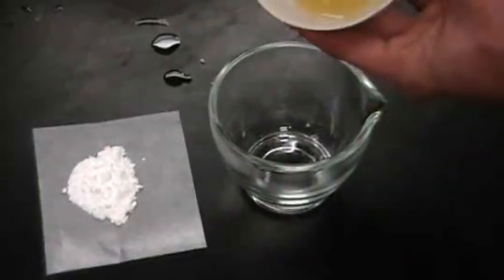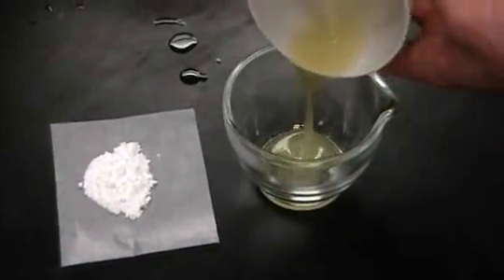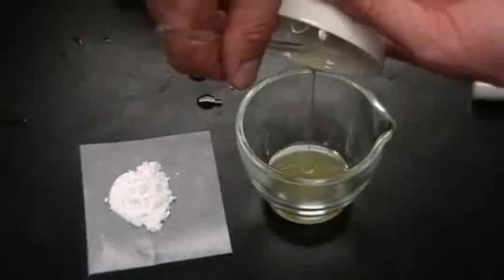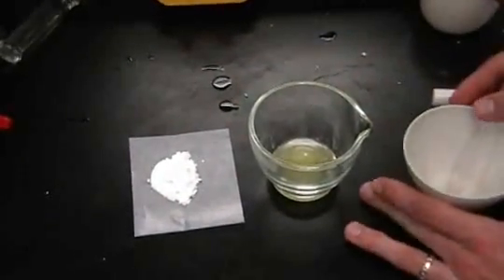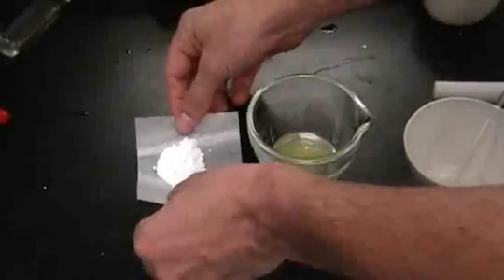Then, take your cocoa butter that's melted or your PEG, pour it into your glass mortar. You're going to add your active ingredient here, and you're going to add it in 3 portions, adding it slowly while mixing it.